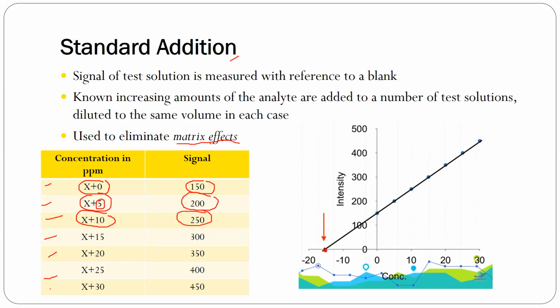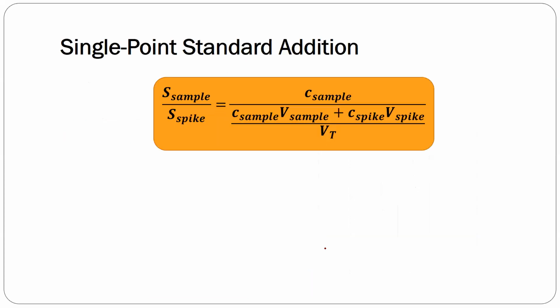So ganoon lang kasimple yan. Pero medyo matrabaho siya, di ba? Although halos parehas lang nung calibration curve method, you just have to add and add and add. But sometimes, para mas mabilis yung ginagawa, they do what we call single point standard addition.